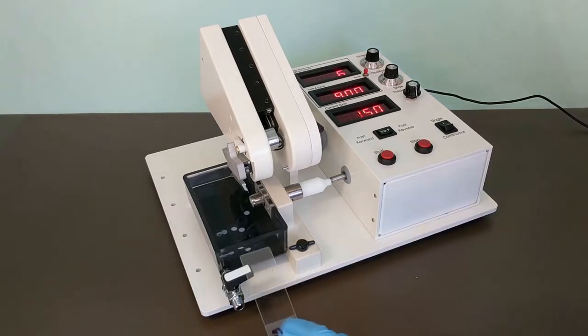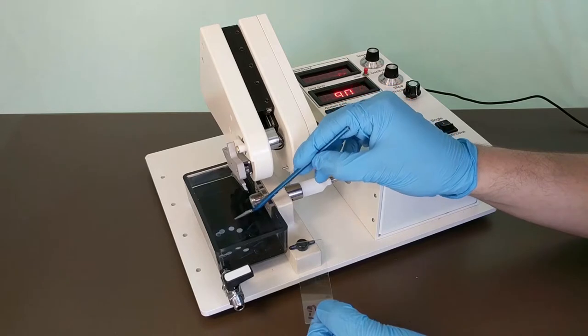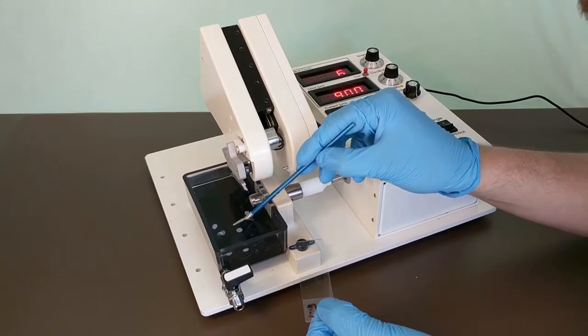In order to plate your samples, we recommend using a fine paintbrush to grab a slice and roll it onto the microscope plate. Take care not to damage the tissue while doing this.